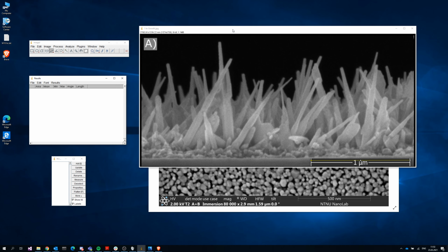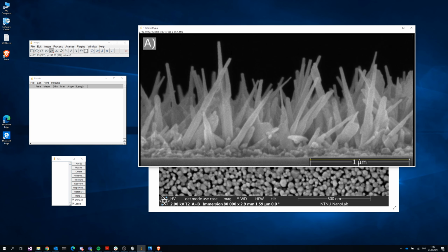Now with taking measurements for nanowires, there's a lot of subjectivity that goes into this, and the results might vary per group. So it depends on you. Just pick a rule set when you label these things and try to be as consistent as possible. For your images, the ones that I've already seen, there's a lot of fibrous material or some kind of polymeric residue, and we might have to clean them off a bit before we do the reimaging. But in this case, this is the zinc oxide nanoparticle film.